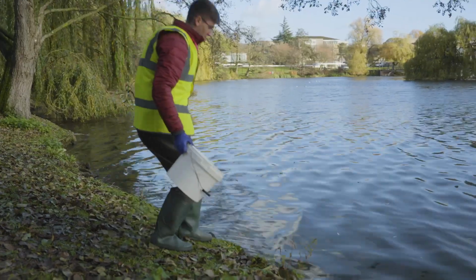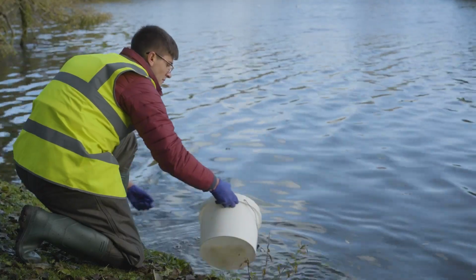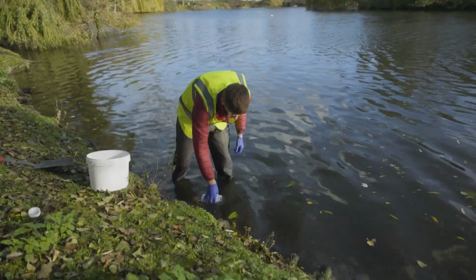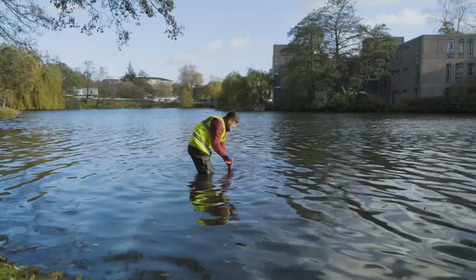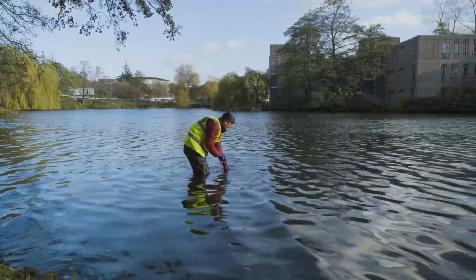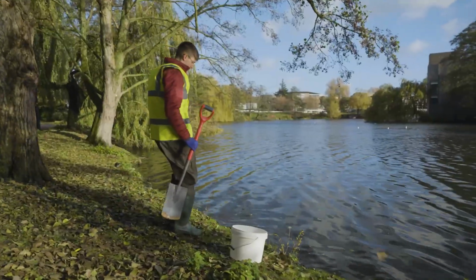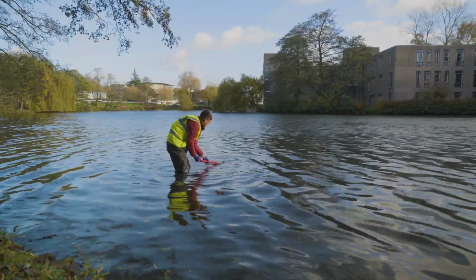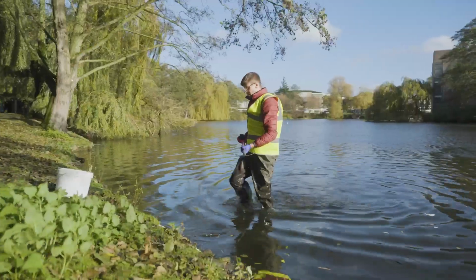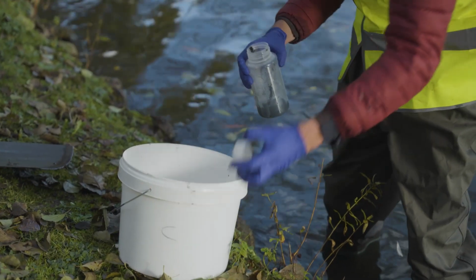For some contaminants, you may want to collect both water and sediment samples. Make sure you collect the water sample first to avoid suspending material in the water column and influencing the water samples. You can either collect your sediment sample using a spade, sediment grab sampler, or a sediment corer, making sure your equipment is clean before you start. When using the spade, first ensure it's safe to enter the water body, then shovel sediment into a bucket and safely walk back to the bank. Divide the sediment into the smaller sampling containers, avoiding collecting excess water.